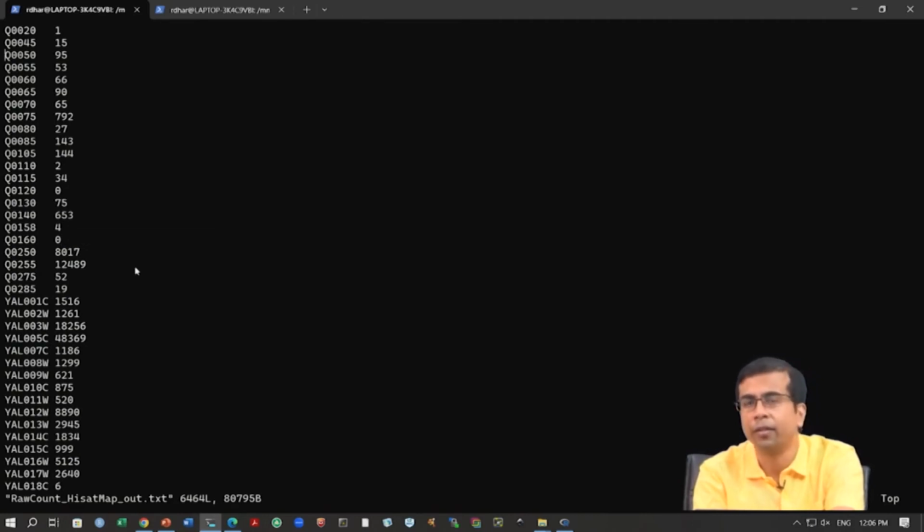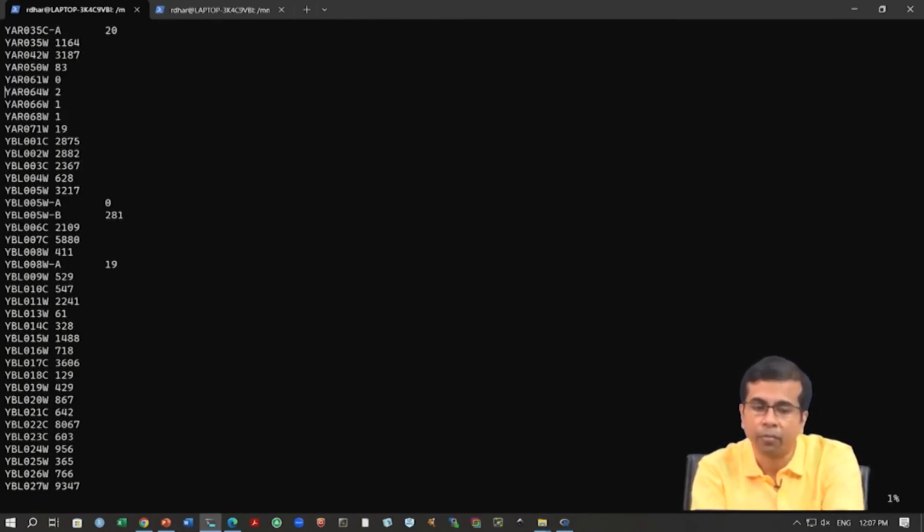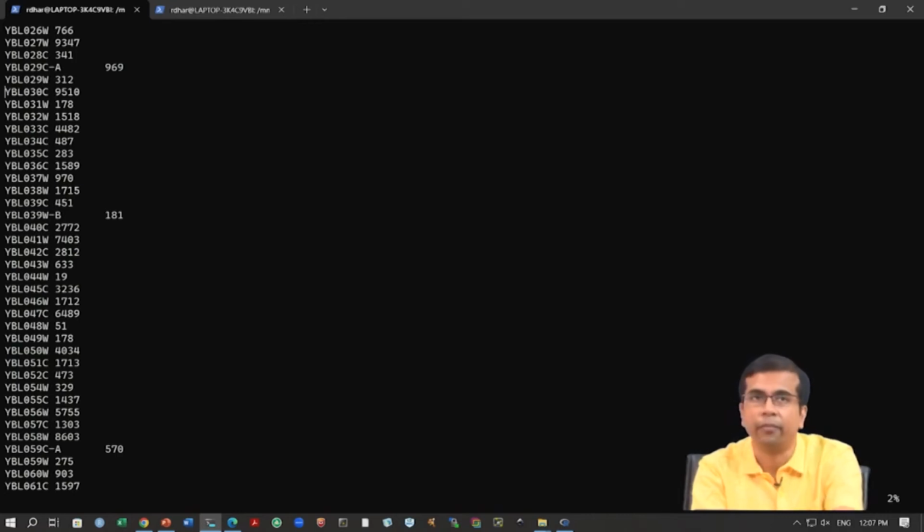But you still have some genes that are probably not expressed, because you see a 0 count. Because you have so much data, you can be sure these genes are probably not expressed or have very low expression. For most genes you have expression, and you can see the read counts. This is the raw read count, and it is a very important step for all subsequent data analysis. Hopefully it is clear how we generate this kind of raw count data from the mapping, using a tool like htseq-count.